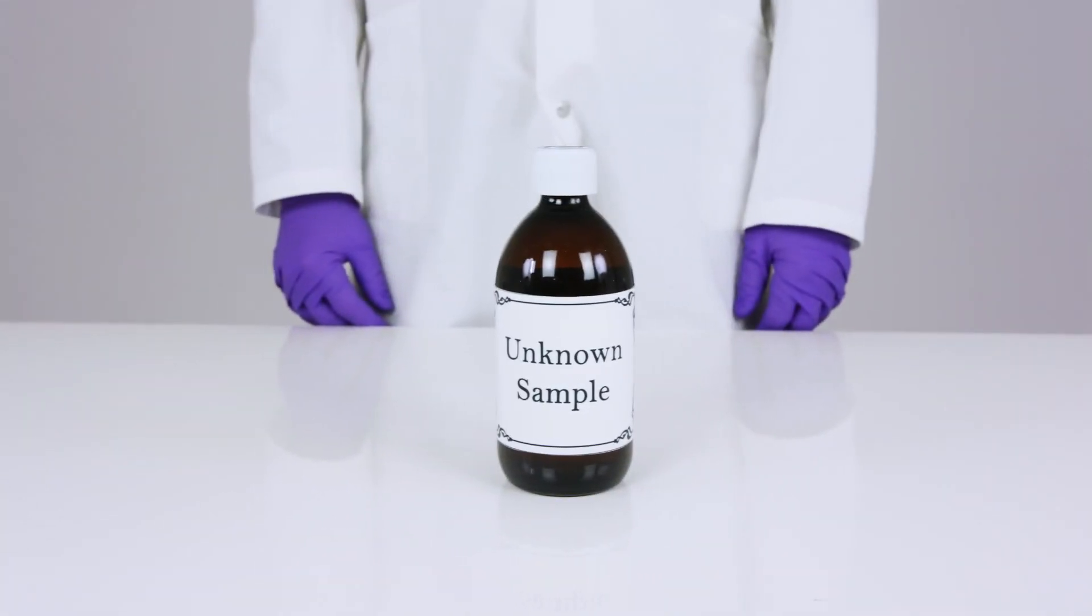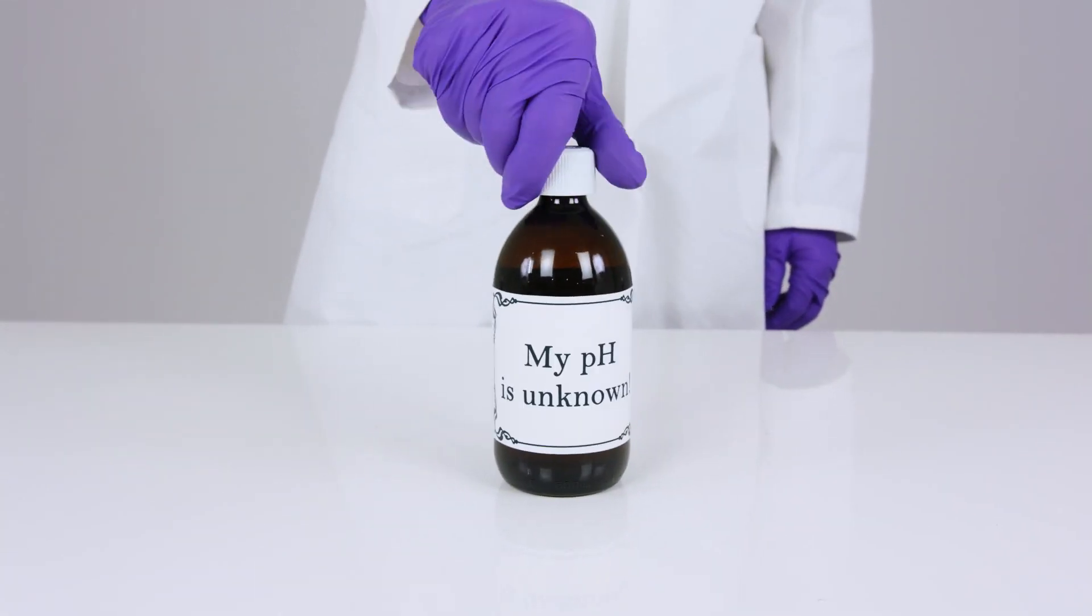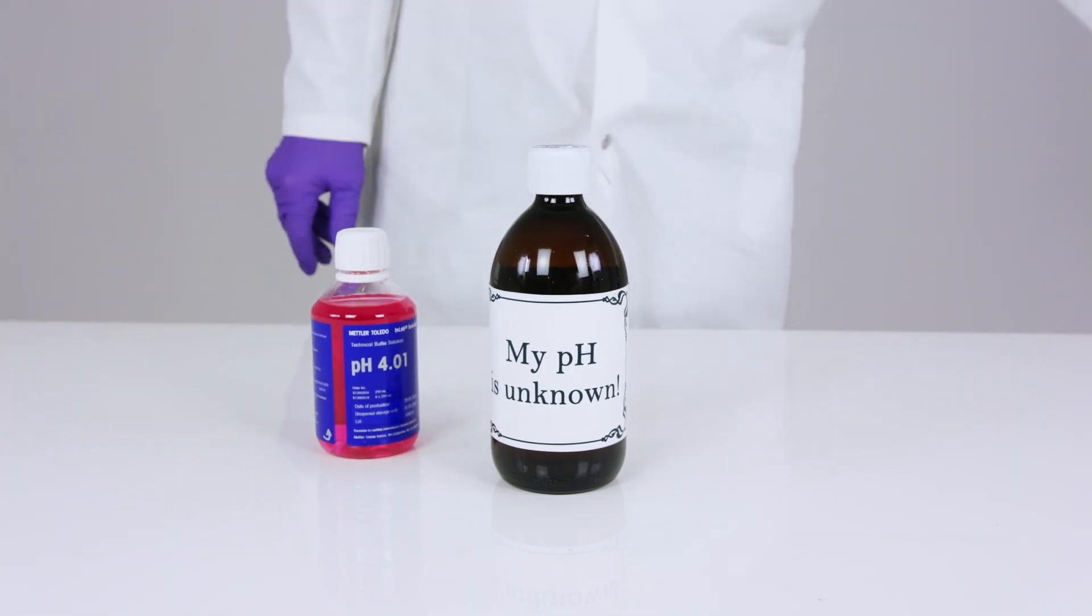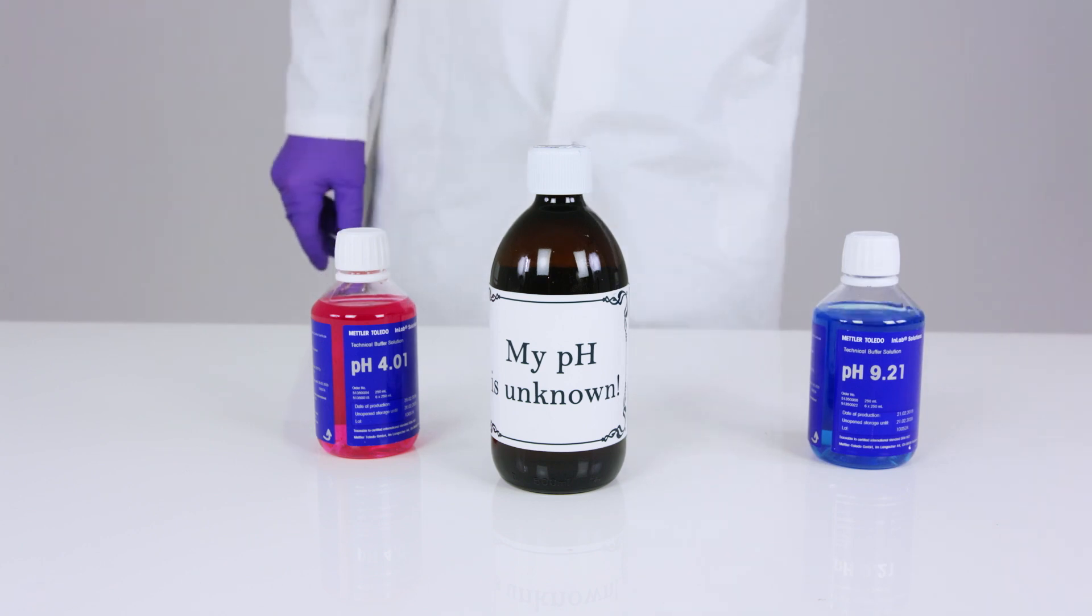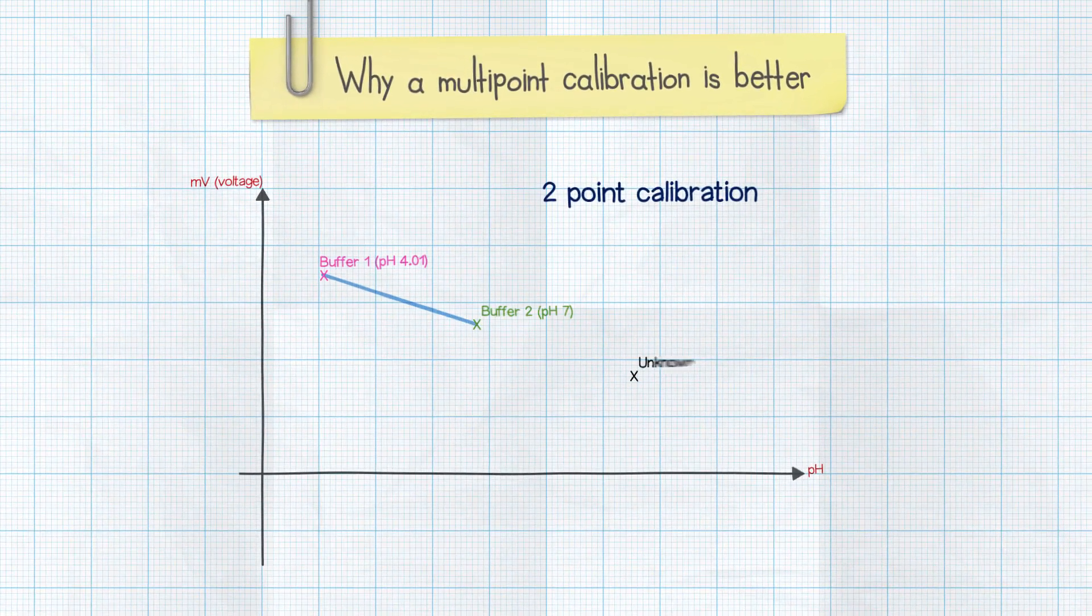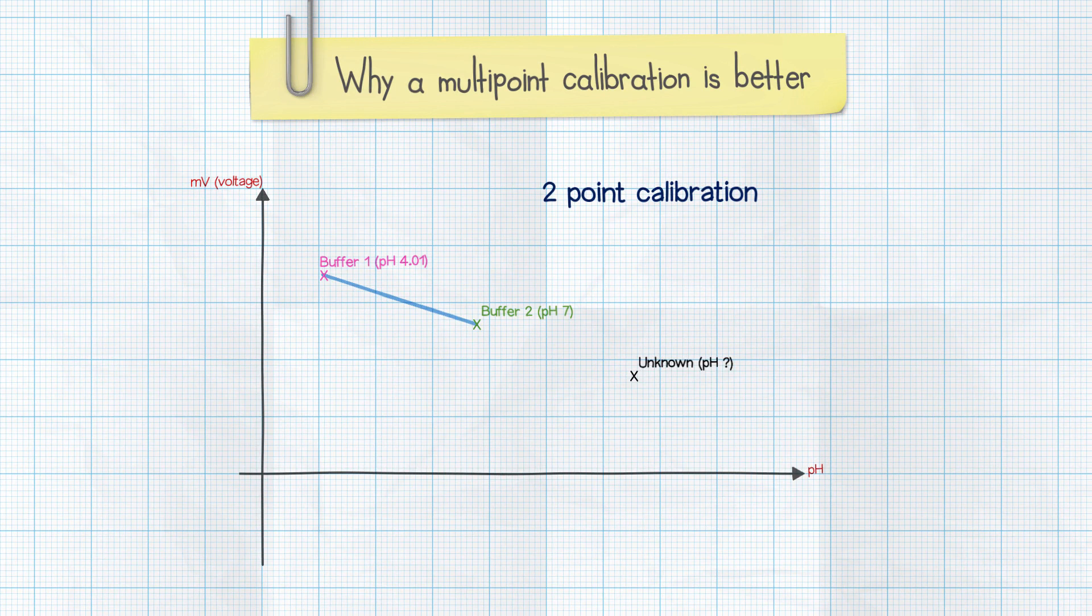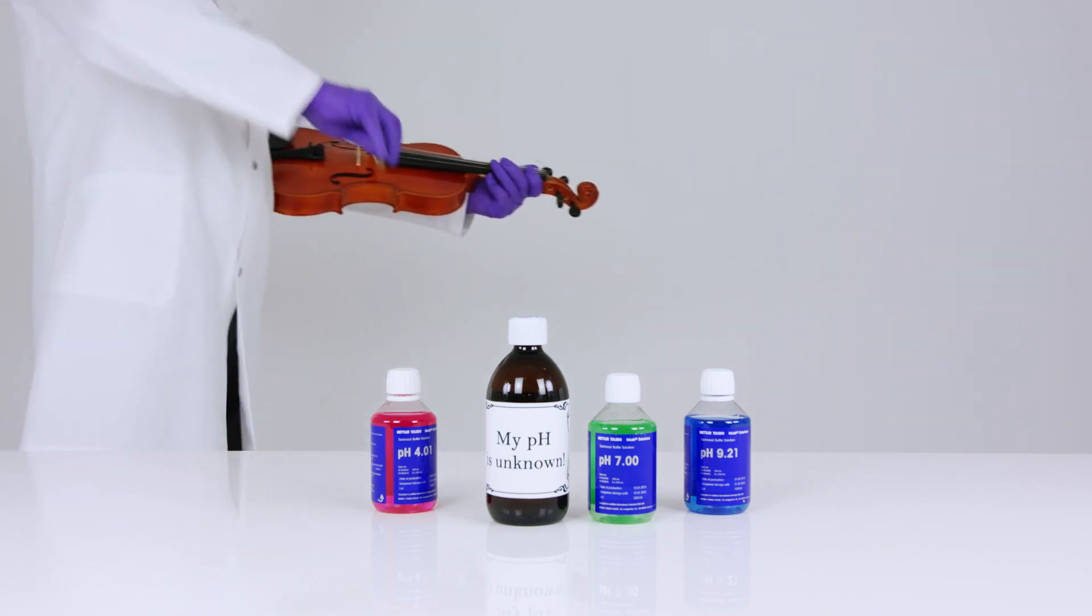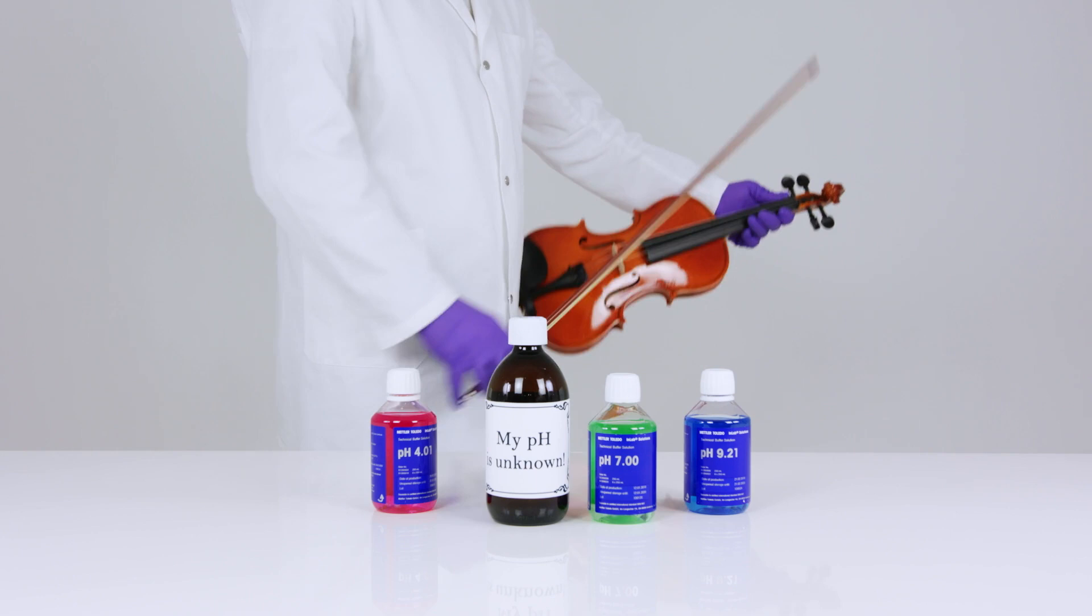If you have no idea what your sample is going to be, or if you're going to be measuring samples with varied pH values, then it's best to use a multipoint calibration to provide a wider calibration range. If you measured these varied samples with only a two-point calibration and the pH sample happened to be out of this range, the reading would be inaccurate. We use a three or more point calibration to provide a wide range without affecting the accuracy of the measurement. It's like tuning all the strings on the violin instead of just one. This allows us to hear more music. No. Hans. Later.